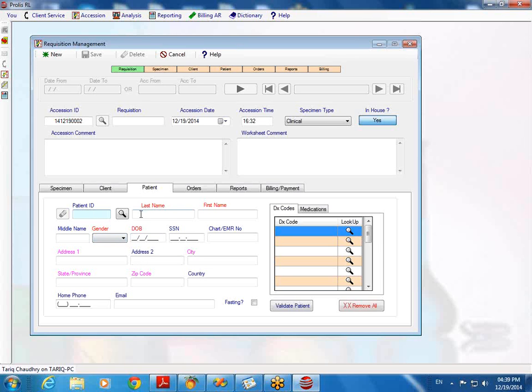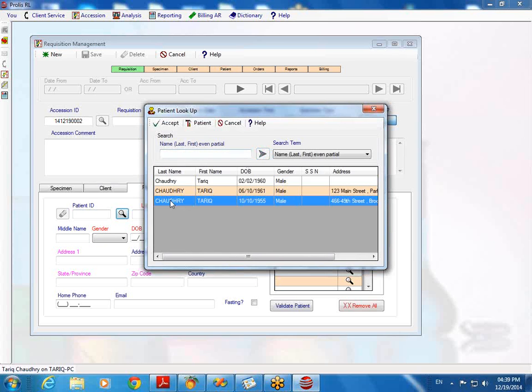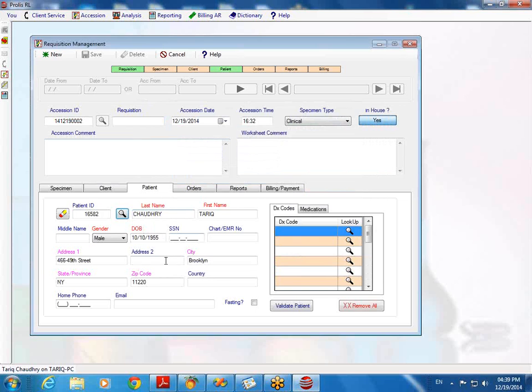when I put in my information, let me pull it again so you can see what I mean exactly. I put this patient here. Do you remember I changed the gender of this patient? Oh, yes. Yeah, to test the pregnancy test. When I changed the gender to female, the system internally created another patient.